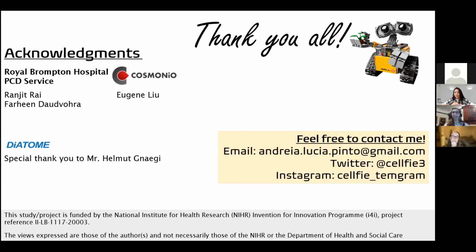I don't need to add 600 images. I usually add as much as I can. By the end of having like 1,000, we already had a good performance of the machine, but the more the merrier. But we cannot ignore the fact that I was training it alone. So I am giving it my own perception of what is an abnormality, what is a normal cilia. And I actually did a small survey in the beginning. I asked some colleagues, look at these 10 cilia and tell me about the central pairs. And it was a catastrophe. It was really bad. And I thought, oh my goodness, I need to check this on a large scale. I need to check agreement.